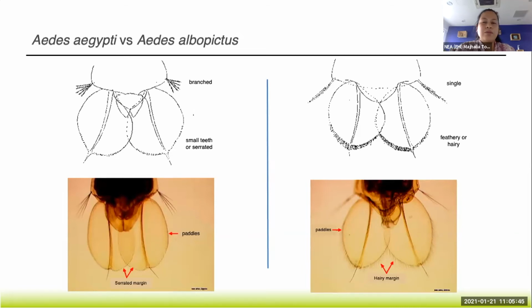Before the break, I will just answer a few questions. You can use L3 for ID, but L2 and L1, sometimes we let them grow a bit so that we can see the characteristics better.